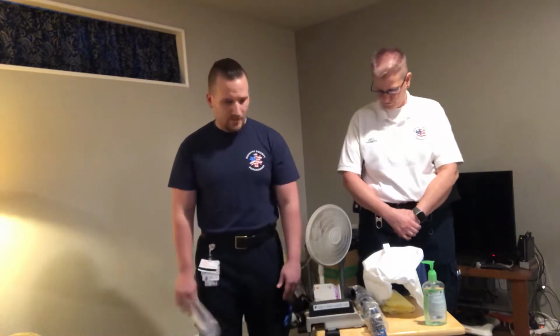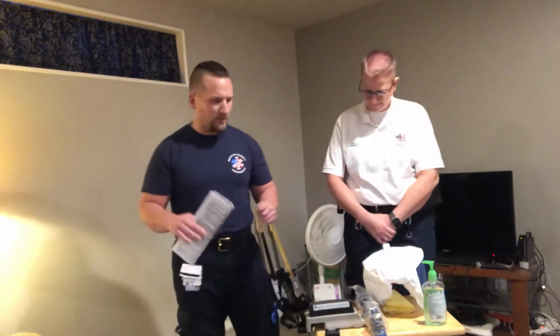Anyway, we thought this would be a good opportunity to, in addition to our earlier PPE demonstration today, run over the PAPR. Jody and I both have the opportunity to work with these at Air St. Luke's, so we have a little more knowledge of their operations and benefits than most. So don't hesitate to wear this if you have a COVID positive transfer, or just if you, like some people at my other job, failed the fit testing for their N95s, and so they have to wear these on any even possible exposure. So without further ado, I'm going to run through the steps of the PAPR.